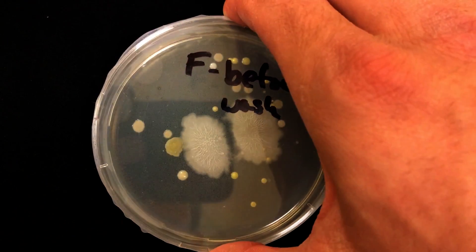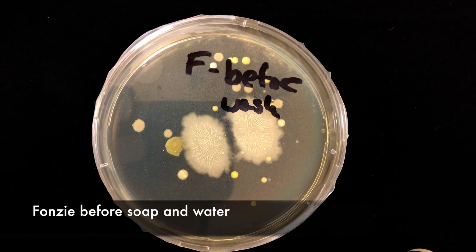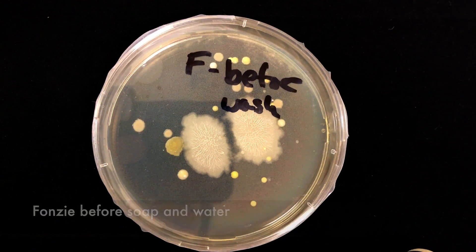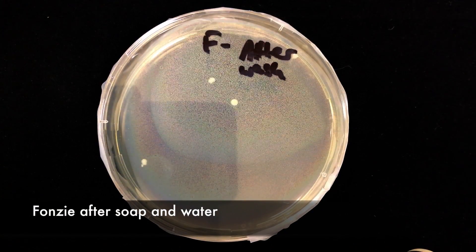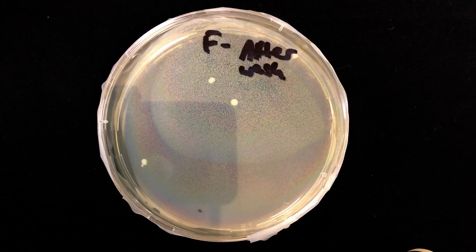So as a comparison, let's see how good old-fashioned hot water and soap does. This is my sample before I washed my hands with soap and water. And this is my sample after I washed my hands with soap and water.